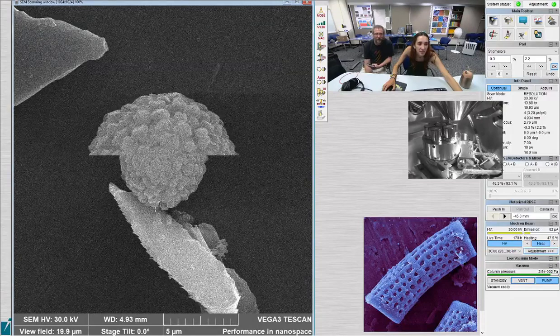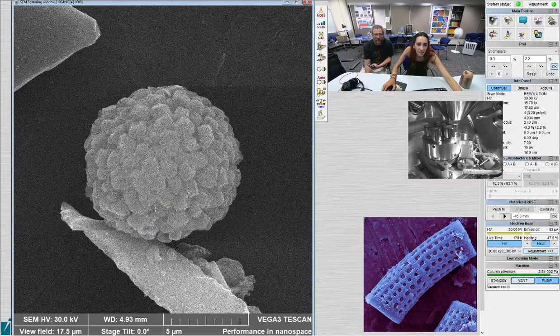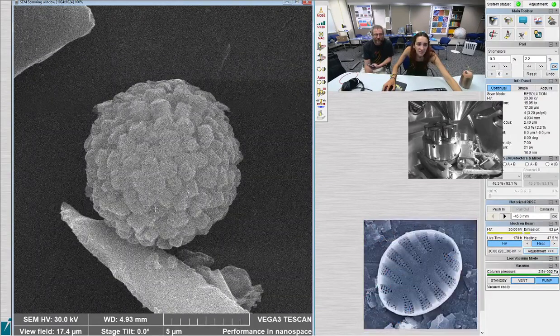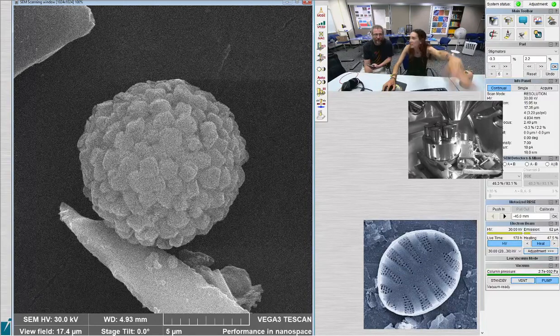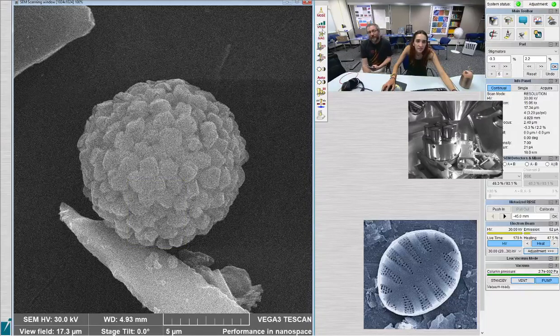Whoa. It has a very interesting pattern. Yeah, it's just a ball. Is this a chrysophyte? I don't know what that is. Could be a chrysophyte. Maybe the pore is on the other side? Yeah. I'm not sure what that is.